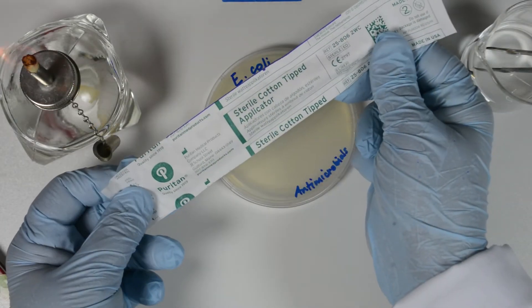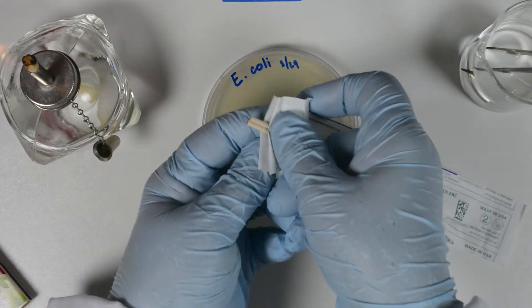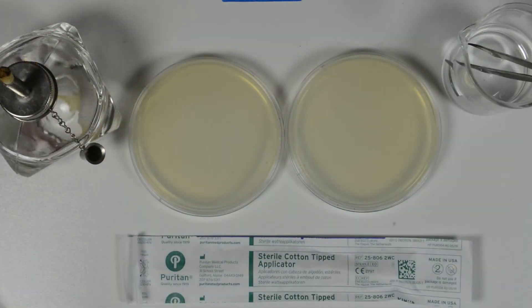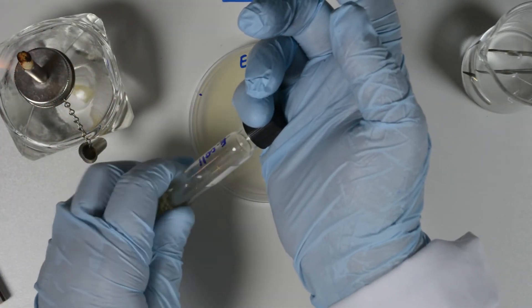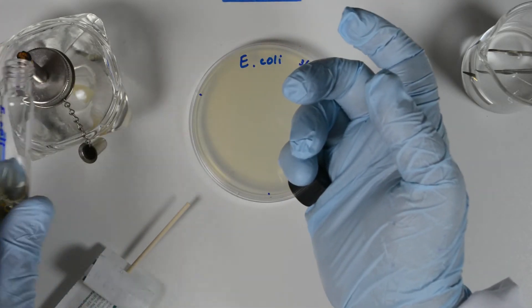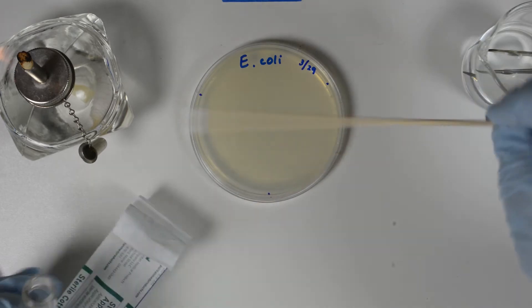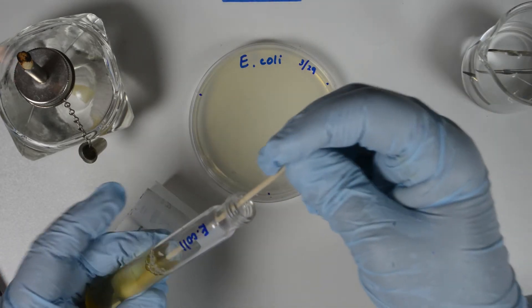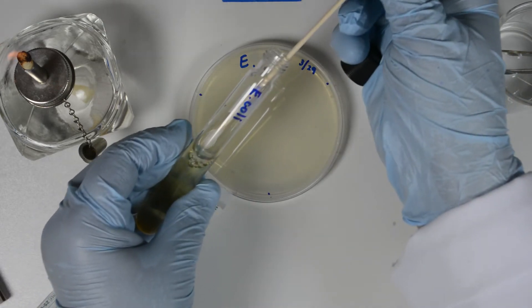Open the end of the sterile cotton swab pouch to allow easy access to the swab handle when you need it. Turn on the Bunsen burner. Now secure the culture tube in one hand, unscrew the cap holding the cap with your pinky finger. Flame the mouth of the tube a few times to warm the glass, which will create some air currents that exit the tube, reducing contamination.